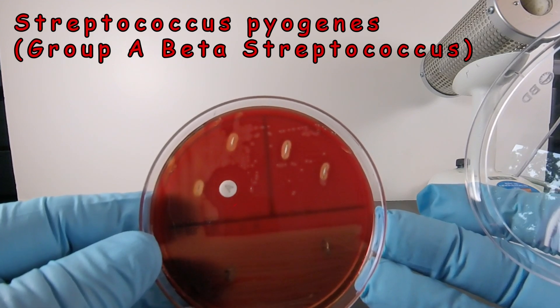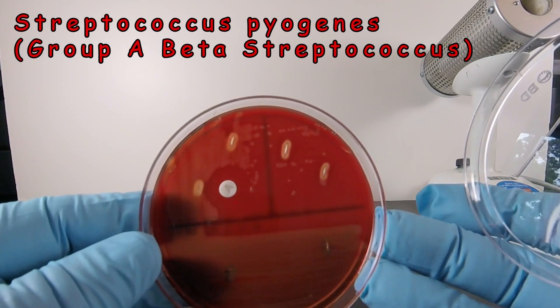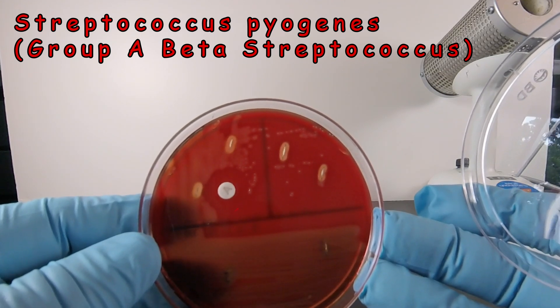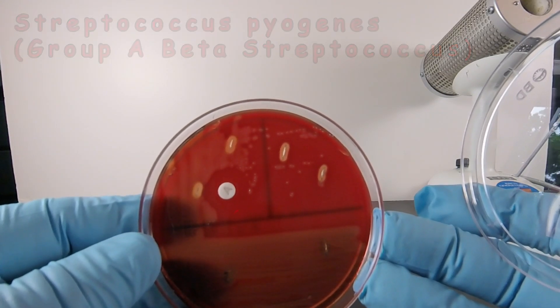So this would be Streptococcus pyogenes or the group A beta strep. Tiny colonies, beta-hemolysis, and sensitive to bacitracin.